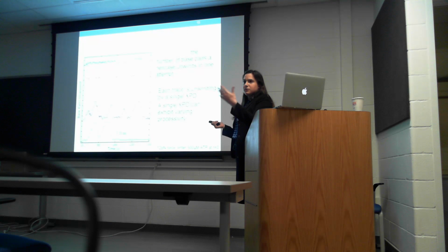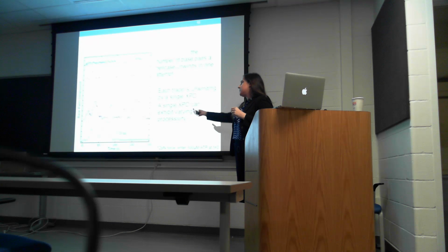Since you mentioned the backstepping, backsliding, this is an example of a burst that I would say is strand switching: XPD moving forward, switching strands, and going backward. These cases where you see a flat top are XPD moving all the way through the entire hairpin, getting to the top, 89 base pairs, where it stops at 90 or 89. Then it continues through to the other side, and the hairpin re-anneals behind it.